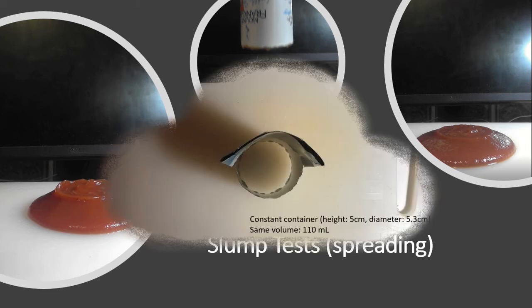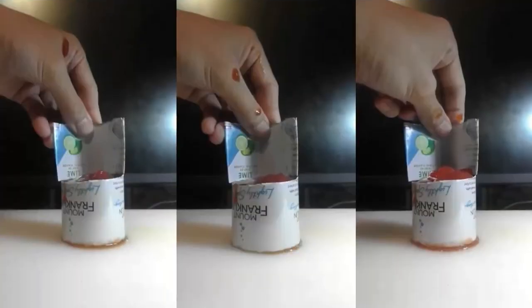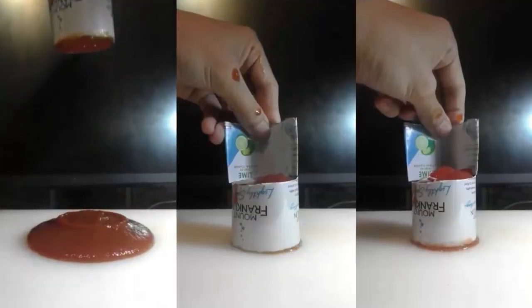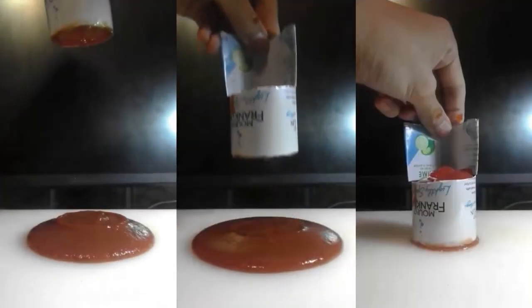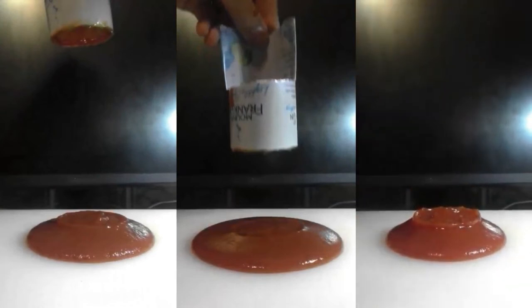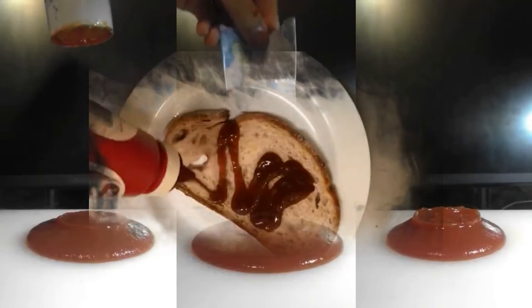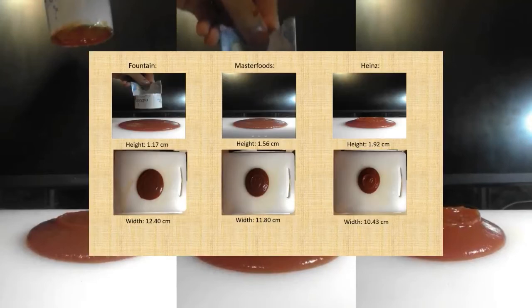The constant conditions are temperature and the volume at the beginning. Then remove the container and the fluid will slump but at a different level. The result of this sample test is obviously shown in these videos. That sauce can maintain a relatively good shape compared with the other two. At the same time, this indicates its high yield stress. As a result, this type can keep the sourdough crispy before you eat it.